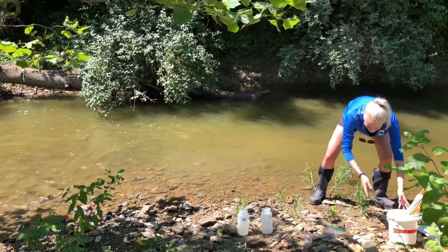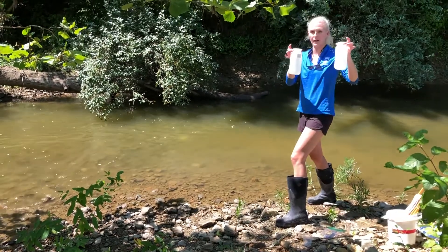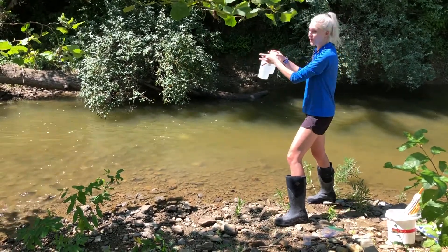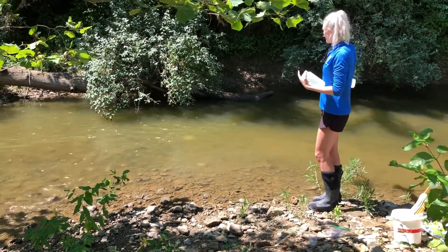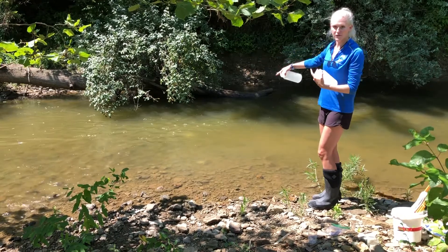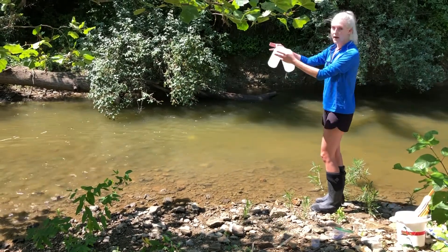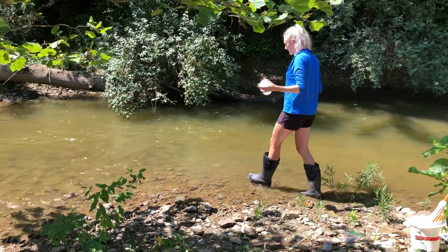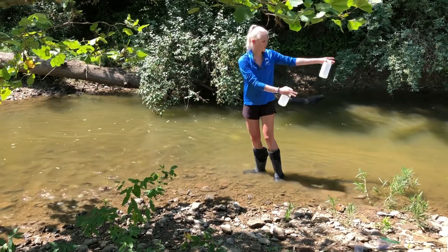Now I'm ready to take my water samples. I have my two big bottles — it's the only thing you need to take out with you as you're wading into the stream. We can see downstream the water's flowing this way. You always want to enter a river or a stream going up the flow. This is important because as we walk, we pick up sediment, and we don't want to sample that sediment — we want the sediment to wash behind us.